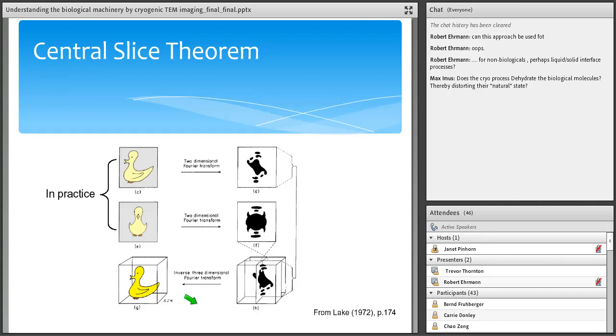So it's interesting, isn't it? There's a lot of math involved here, but one of the things you talk about in a few more slides is how this math has been really taken out of the issue with us because we have all these sophisticated software tools that make it easy for the rest of us. Exactly, and that's happened a lot in crystallography as well, so that you don't have to understand the underlying math or be able to do the underlying math to use these software packages to get a structure.